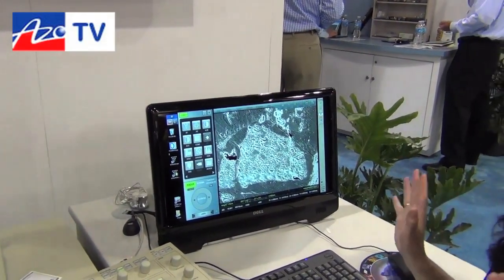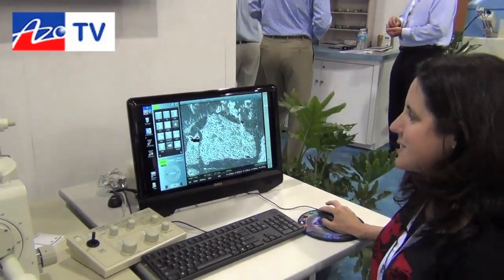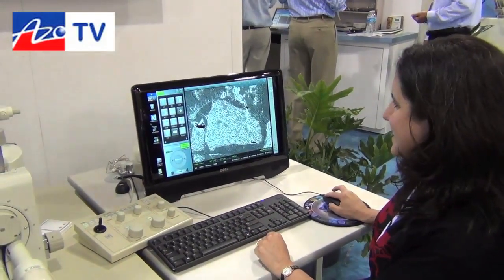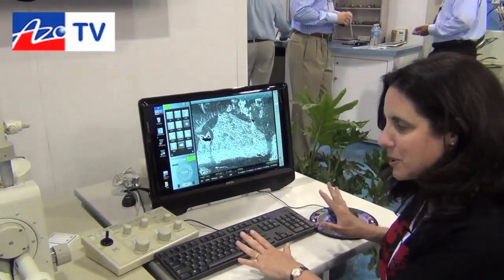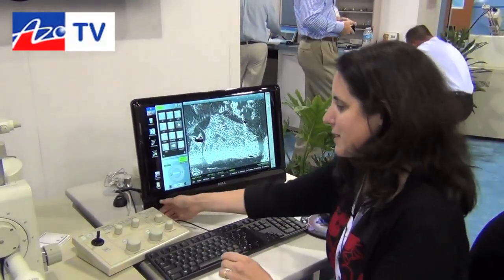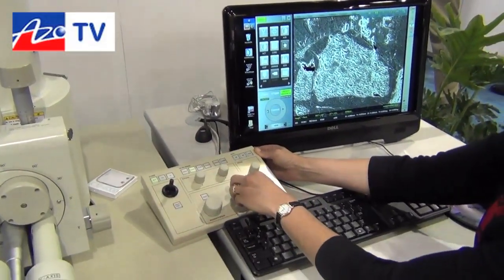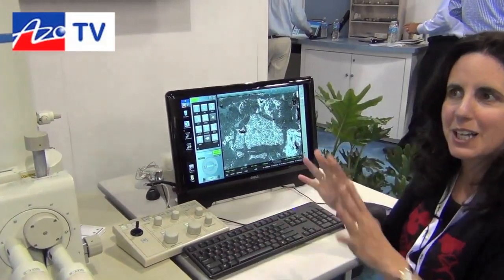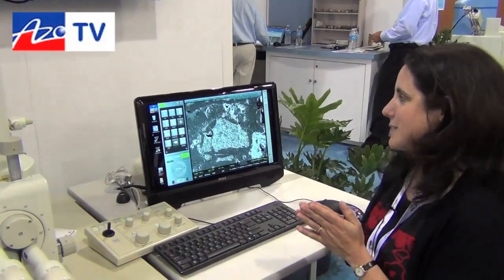If you're a little bit shy about touching a screen or using iPad-like features, you can still use just a keyboard and mouse and make adjustments to contrast and brightness with keyboard and mouse control. And for those traditionalists who insist on an offset, an offset is available so that you can change scan speeds, focus, and go up and down in magnification. We try to accommodate the comfort level of all of our users.